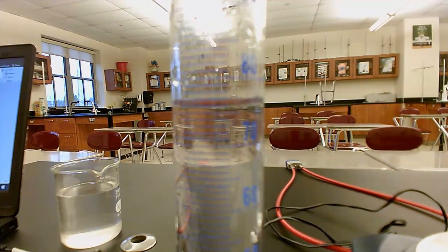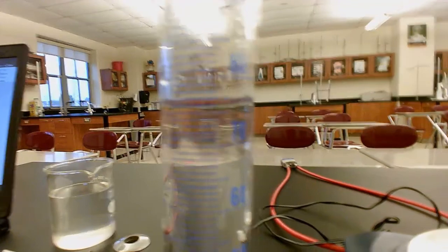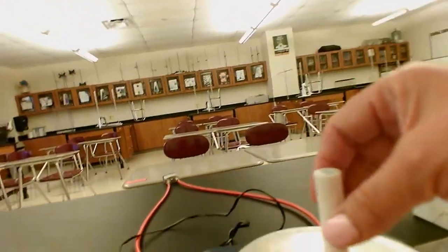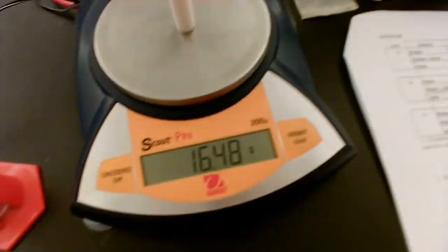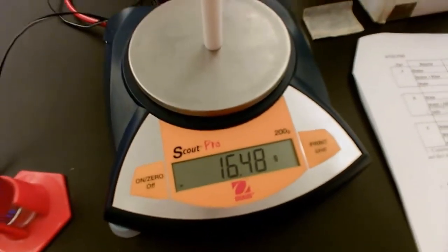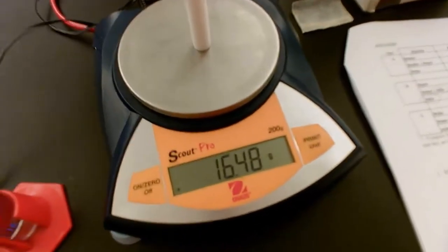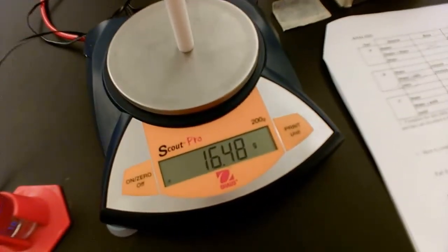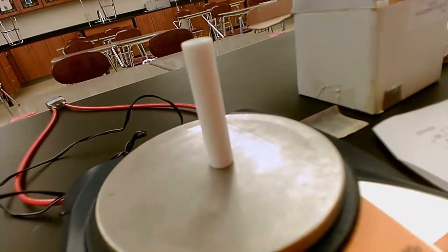The last sample I have is sample I, and here it is. I'm going to put it on the scale, and you're going to get the mass of it. The mass is 16.48 grams. So let's record that. This is for I, 16.48 grams.